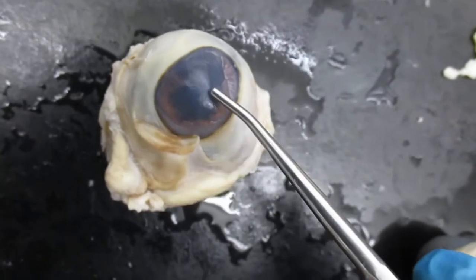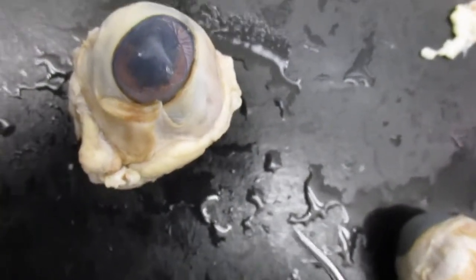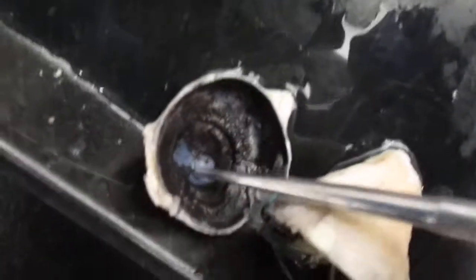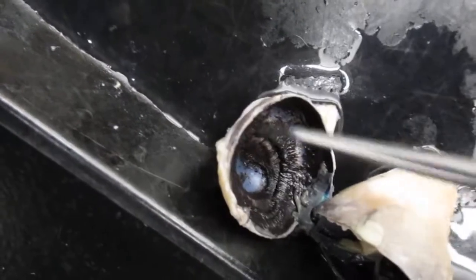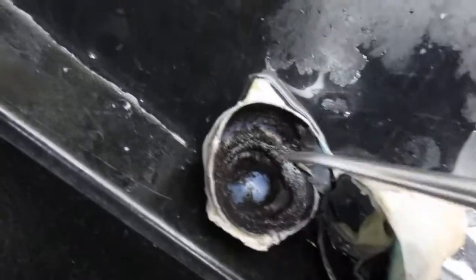This right here, remember, that's your cornea, sclera. Sclera is the white stuff. Tough white stuff, very, very tough. Okay? Right here is your pupil. Right here is your iris.